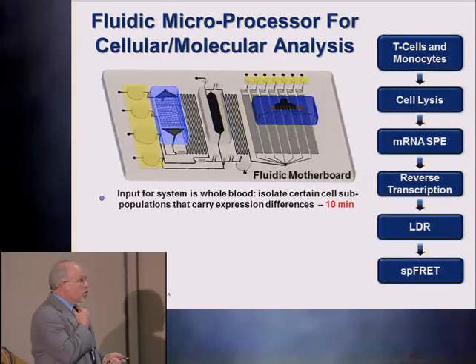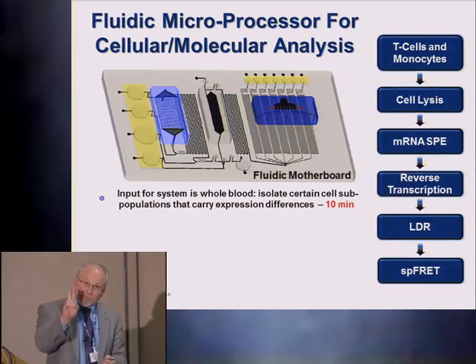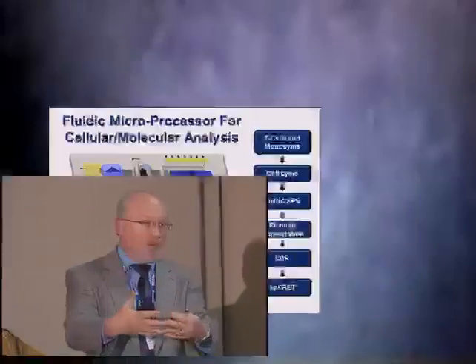And let's take a little look at this. So for this cell selection, there's a couple things that we need there, right? We're going to use a positive selection, so we're going to attach antibodies onto these discrete modules. So we need some surface that we can functionalize. The other thing that we need is something that is moldable, something that we can shape into the particular structures that we so desire.